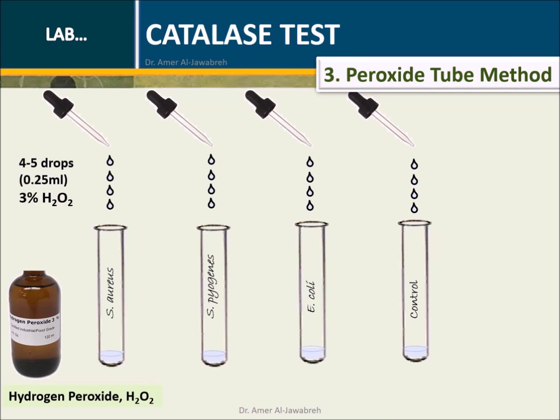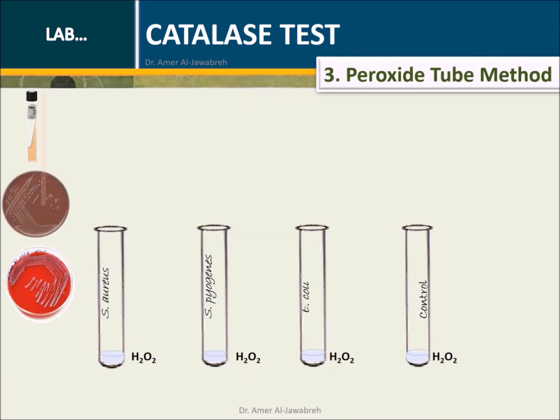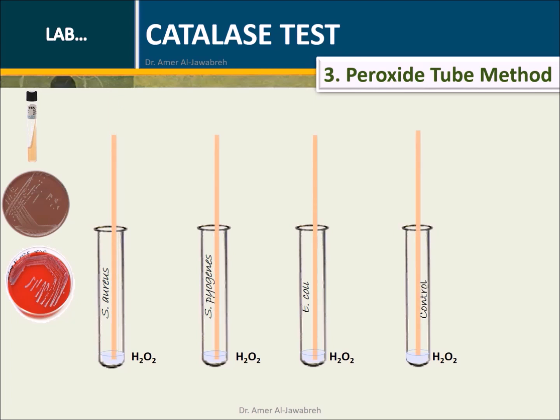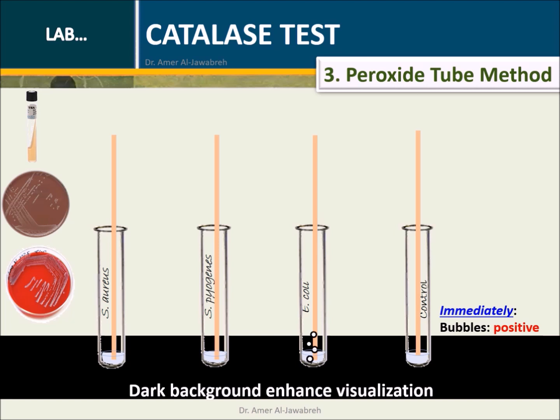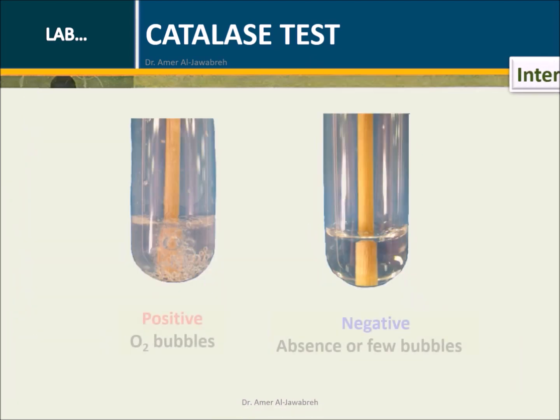Peroxide tube method: Add four to five drops of three percent hydrogen peroxide into a labeled 12 x 75 mm test tube. Using a wooden applicator stick, collect a few isolated colonies from a 24-hour plate and place into the test tube. Do not pick up any agar, particularly when using blood agar, due to the catalytic activity of RBCs. Place the test tube against a dark background and observe for immediate bubble formation at the end of the wooden stick.